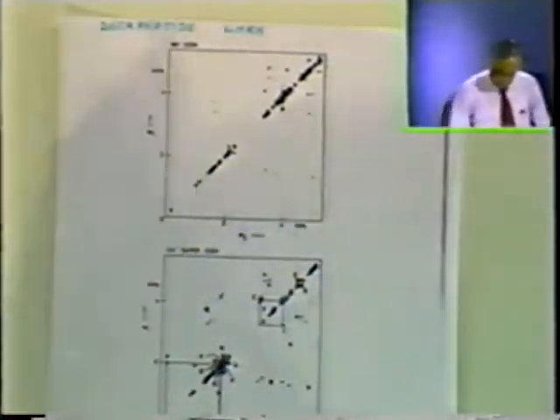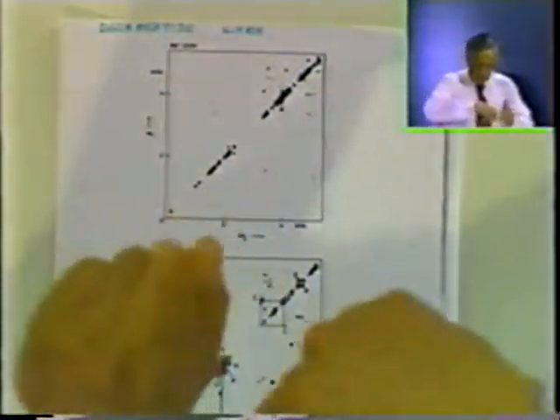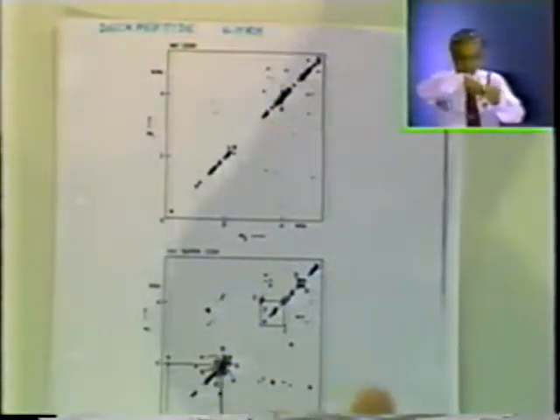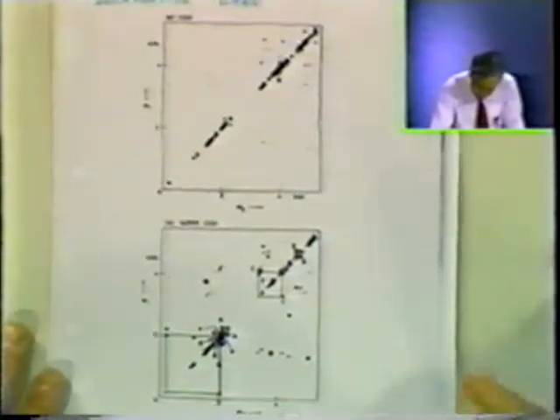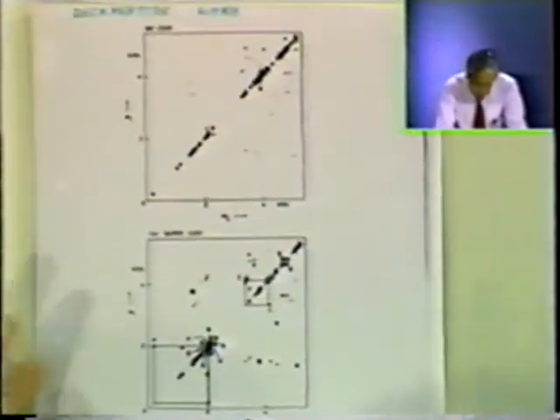It just tells you that it's very difficult to cancel the antiphase. Very difficult to cancel these slightly shifted Lorentzians, which are antiphase. If you just slightly shift them, they're not cancelled. This was news to us. Anyway, okay, when we did a super COSY experiment, you can see exactly 20 minutes.